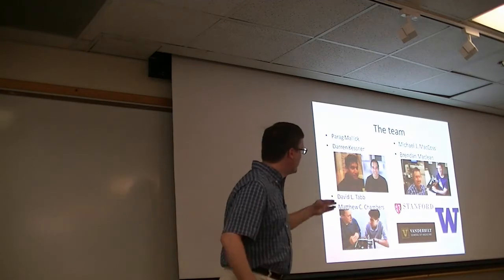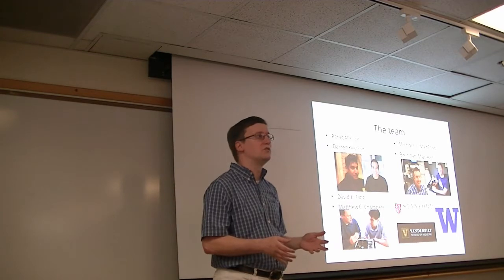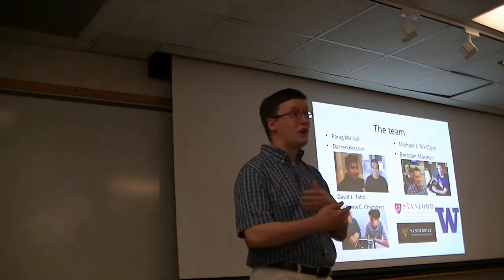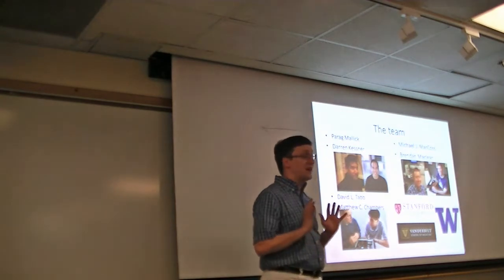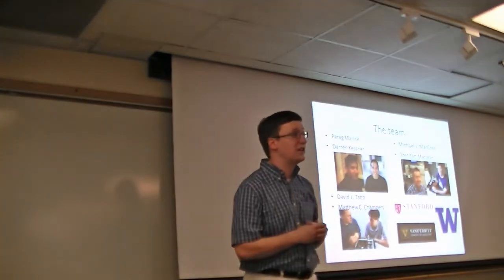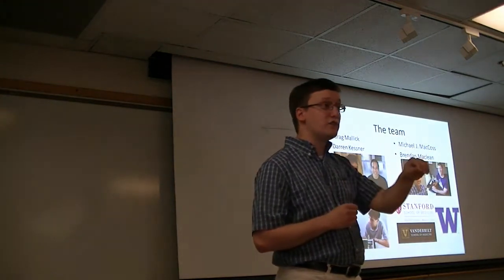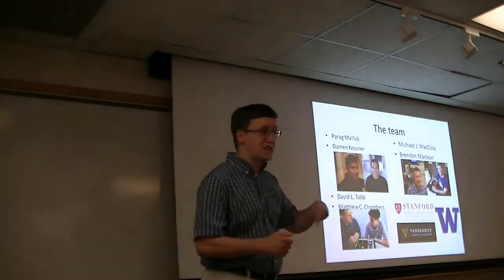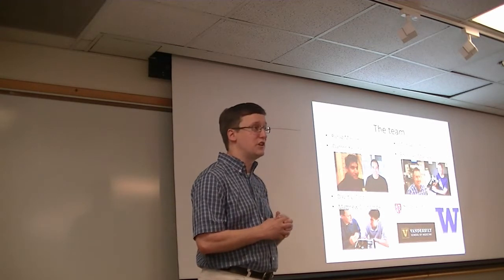So that effort has taken off from very small beginnings to become something that's really huge. There are lots of people out in the world who know Matt Chambers because they know ProteoWizard, because they use it all the time to convert data within their labs. But I cannot diminish in any way the impact that the collaboration with Mike MacCoss and Brendan MacLean have brought to this. They have been far better at recruiting vendors who want to get their instruments supported within ProteoWizard, and they brought actual money into the project to pay salaries of people as well. So this has been a really hugely valuable collaboration among these three laboratories.